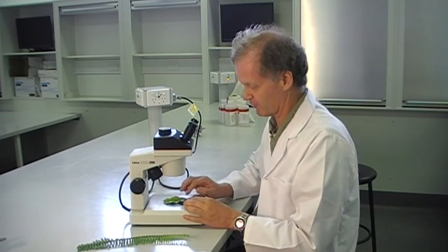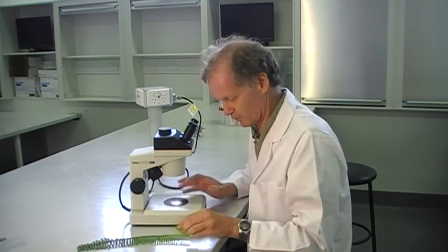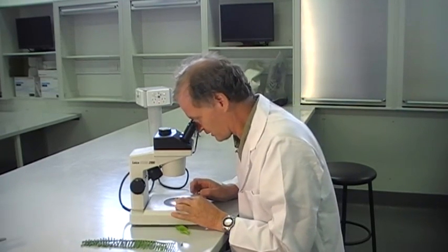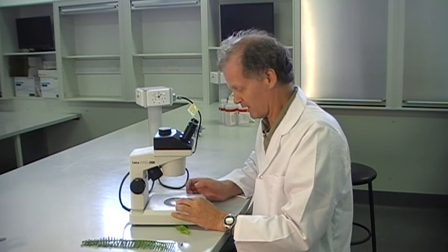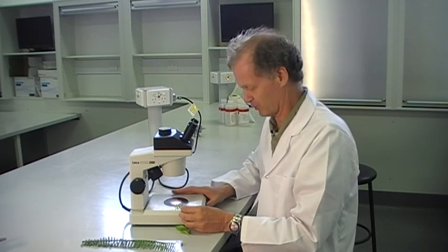But most of the time we want that bottom light turned off. Part of the reason is that if you do leave it on when you're looking at, say, some leaf material, it's like looking into the headlights of a car — it sort of blinds you. Also, the stage here starts to warm up after a while and sort of dehydrates whatever you put on.